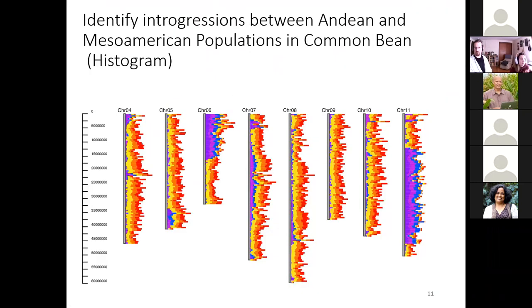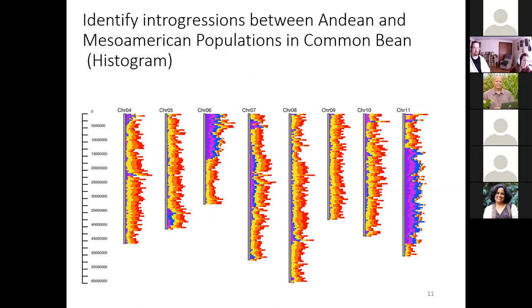Here are further examples of gcivet use. In this example, introgressions between Andean and Mesoamerican populations in common bean are identified: an Andean line is used as a reference, with differences between three other Andean lines shown in cool colors (purple, pink, and blue), and differences between Mesoamerican lines and the Andean reference shown in warm colors.